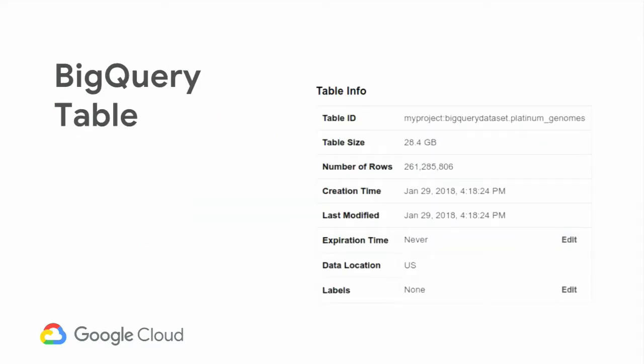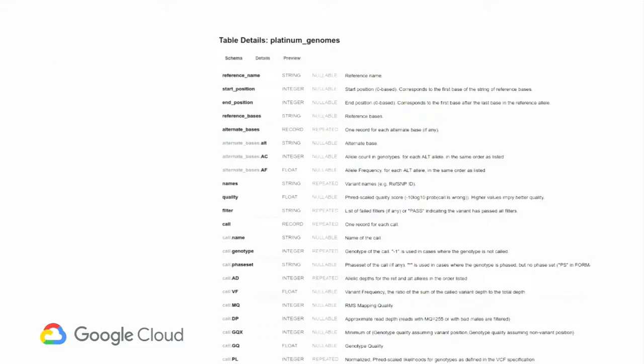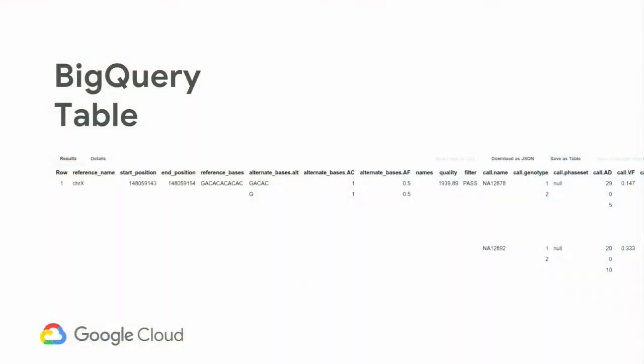So now, what does this look like in a BigQuery table? This is basically an example table loading platinum genomes, six samples from it. It contains GVCF files as well, so non-variant records. It has about 261 million rows. This is what the schema looks like. Basically, it's generated dynamically based on the input and everything is properly typed. And this is an example of what a row looks like. So basically, there is one row for each variant and all the samples are nested under. And there's basically a one-to-one mapping of everything that's in a VCF file to everything that shows up in BigQuery.